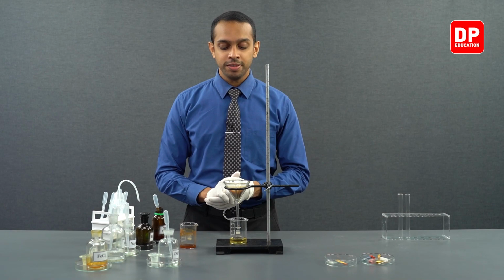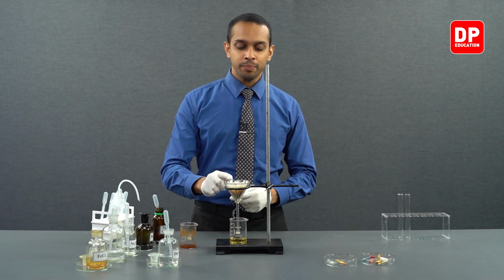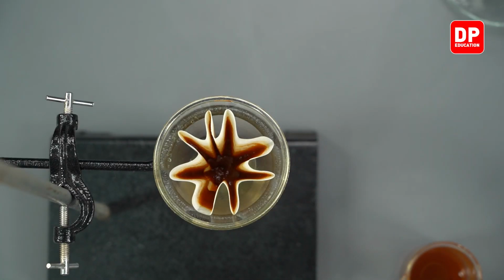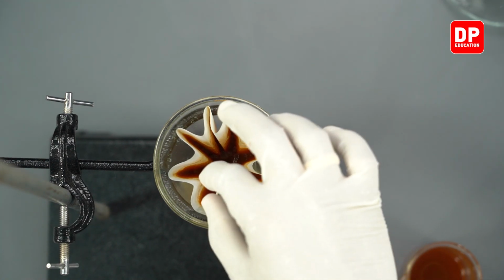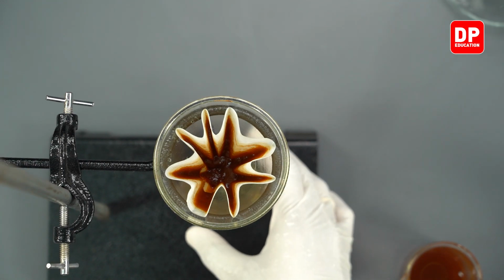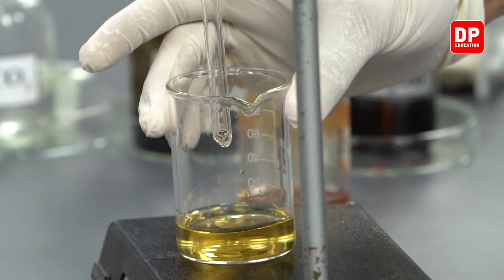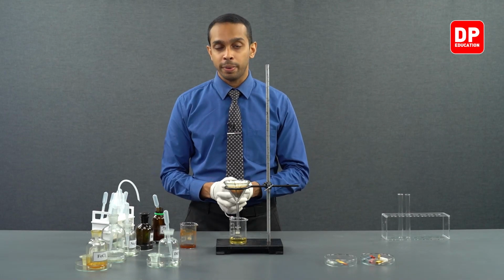Now we have allowed the filtration to happen for a while, and if you take a look at the top view, we can see the brown color precipitate remaining on the filter paper. What you see here is ferric hydroxide precipitate, which is a brown color precipitate, and you can see at the bottom the filtrate is a yellow orange color. This is due to the presence of Fe3+ ions.